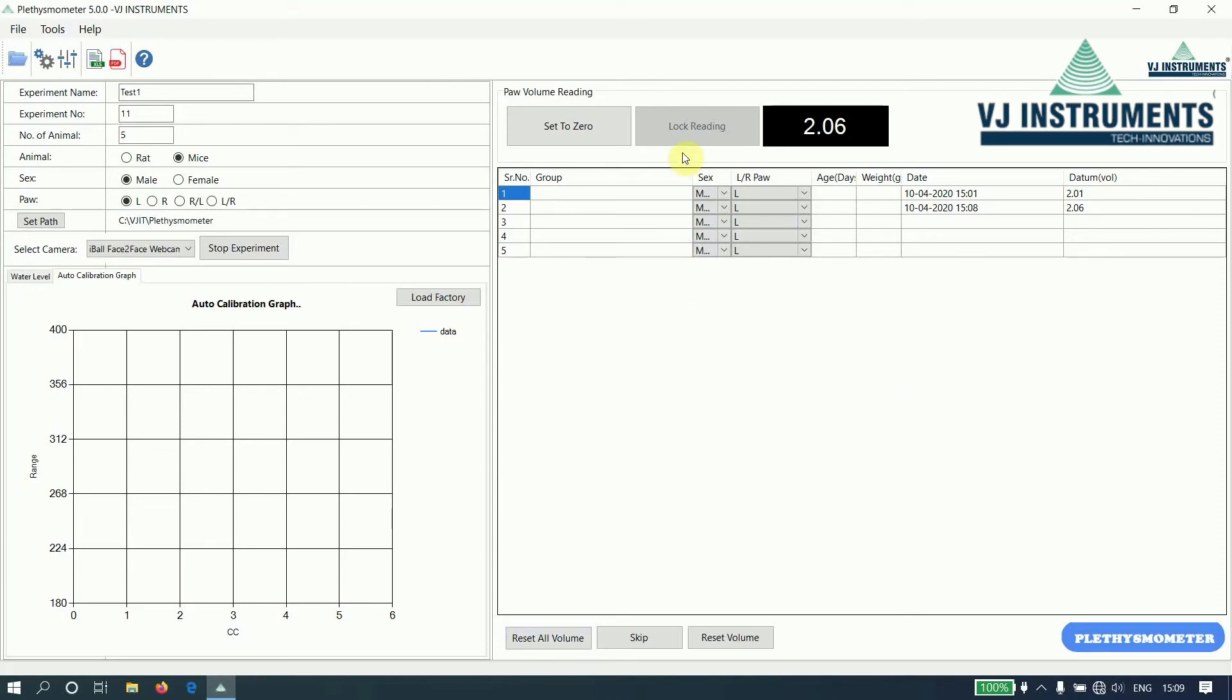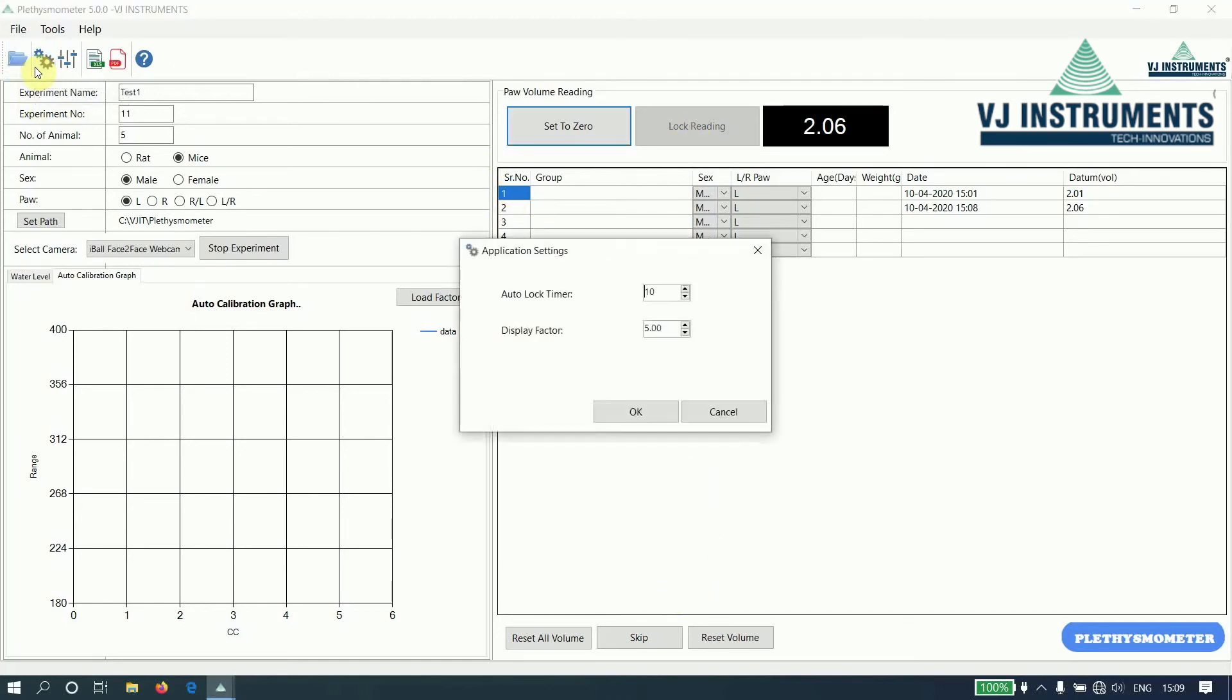The lock reading timer can be changed in application settings. By default, it is set to 10 seconds. We can change it here.